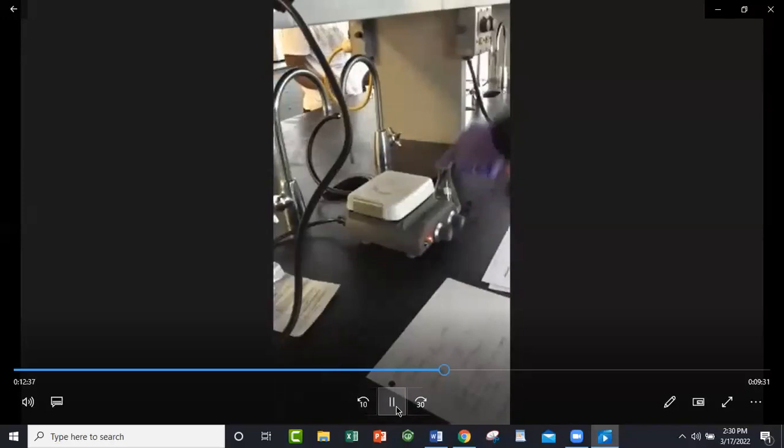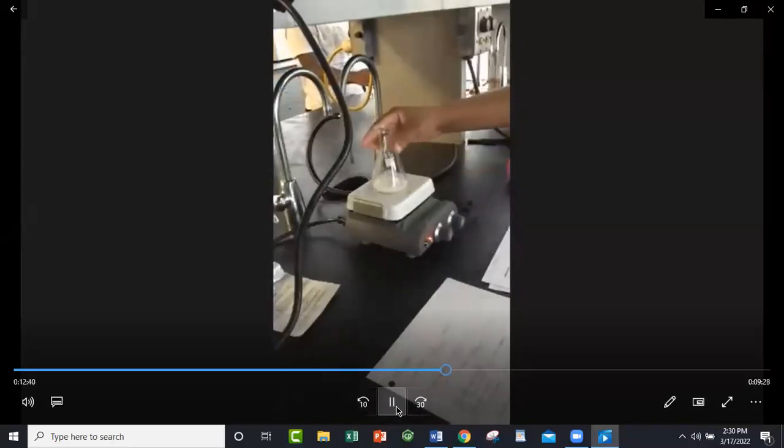Spoke too soon. Just turn that down. Go ahead and put that back. Keep swirling. Keep it on the hot, because it's got to stay hot. If it's not hot, then it's not going to dissolve.